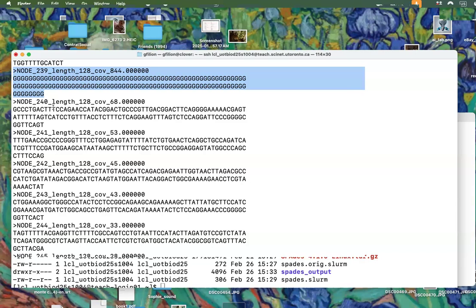It's a known artifact of the sequencer that they use: whenever there's no DNA, it sequences G instead. I know that's weird, but when it sequences something like dust, it thinks it's a G. We don't have time to explain exactly why that is, but if you ever work in genomics, you'll remember, oh yeah, that's the artifact that Dr. Fillon mentioned, the one that produces way too many Gs. Anyway, that's not real. This one is maybe real, maybe not. But anyway, the length is 128.